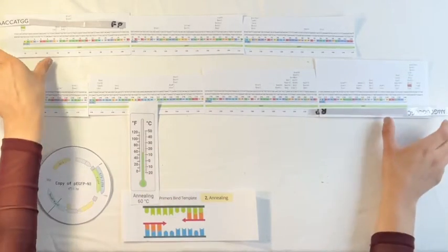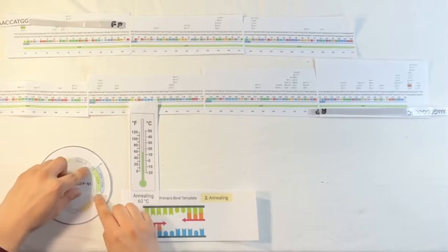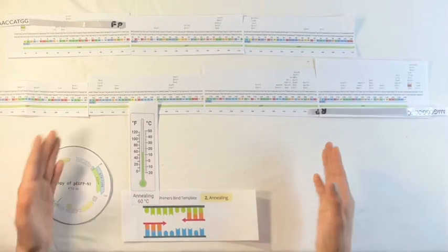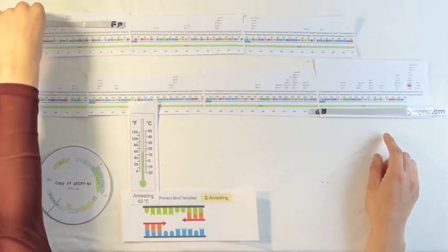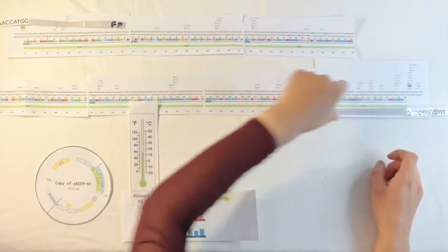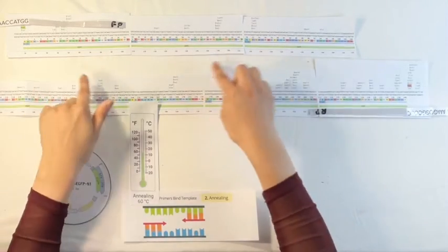These primers are going to flank the EGFP gene at both sites. The reason we want them to flank the EGFP gene is so that we can only amplify everything between the segments, and therefore only amplify the EGFP gene.